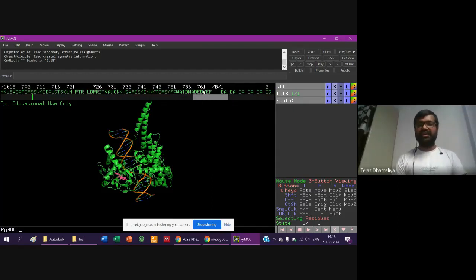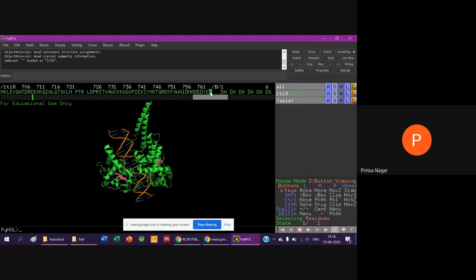There are nearly 770 amino acids, 765 amino acids present. More than 500, sir. How would we know which amino acid is denoted by which letter?